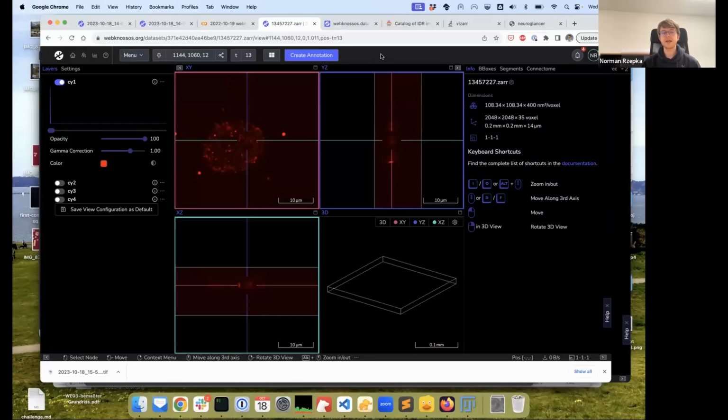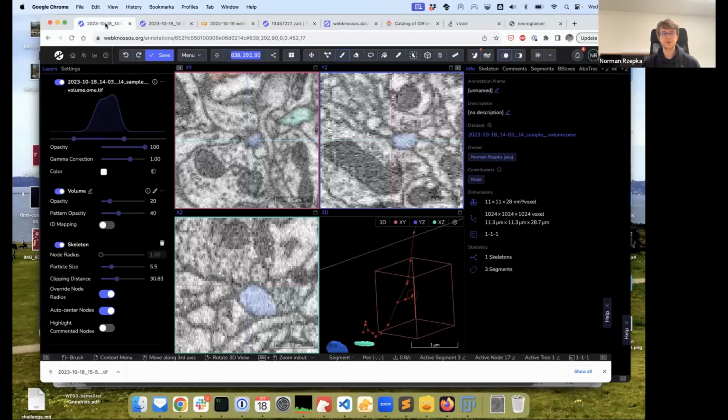And then the last feature that I wanted to show you is also, oops. Sorry. One useful feature is that there's also an undo feature. So if you happen to brush or do something dumb, it just undoes that. By the way, it also has an autosave. It saves every 30 seconds or so, so you don't have to click this button on your own, and everything will be stored on a server and backed up there, so you don't have to worry about that kind of stuff.